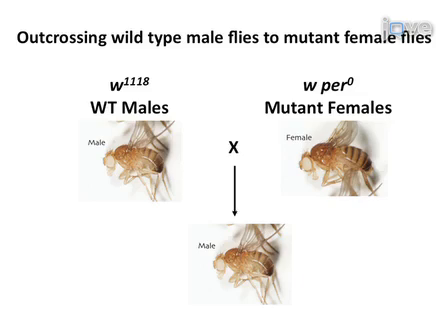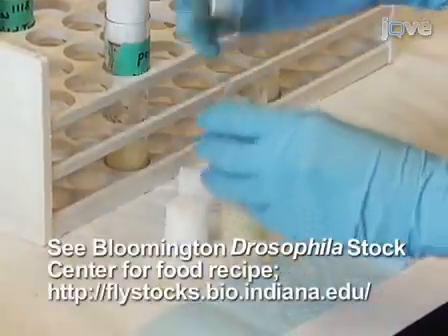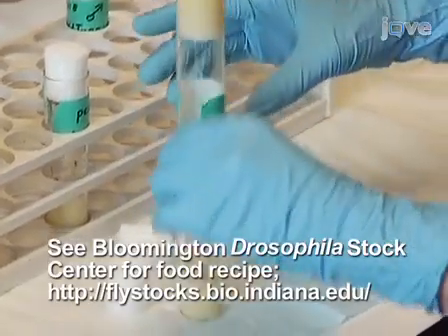When examining circadian and sleep-rest parameters of specific mutant flies of interest, it is prudent to outcross the mutant stock with the wild-type strain of the same genetic background, for example w1118 or yw. Since there is no crossing over in Drosophila males, it is better to perform the outcross by crossing mutant females with wild-type males.